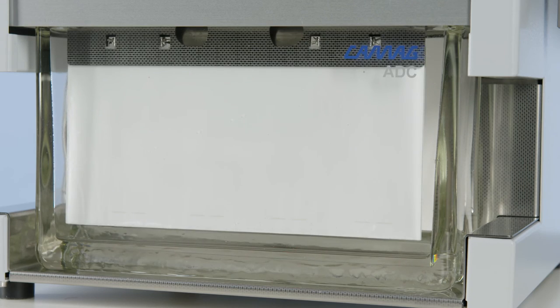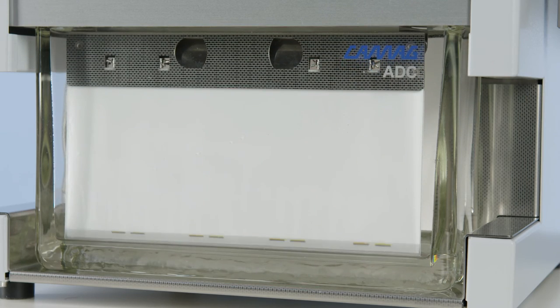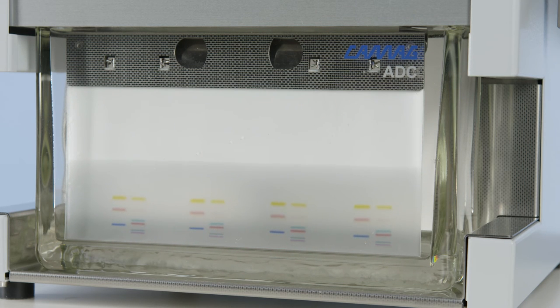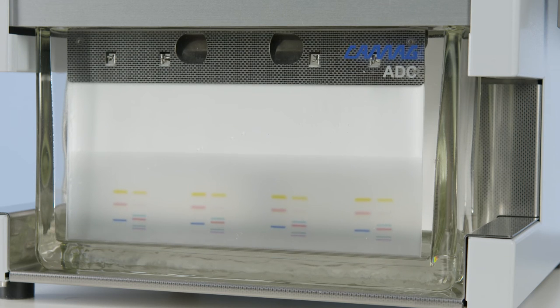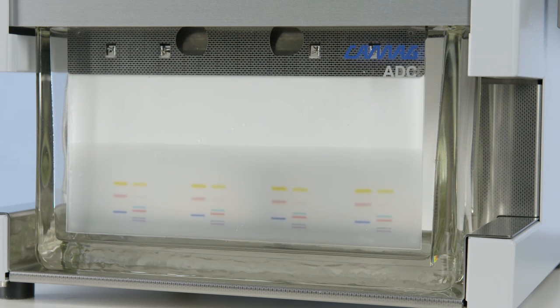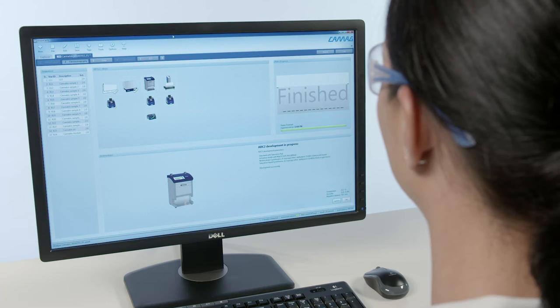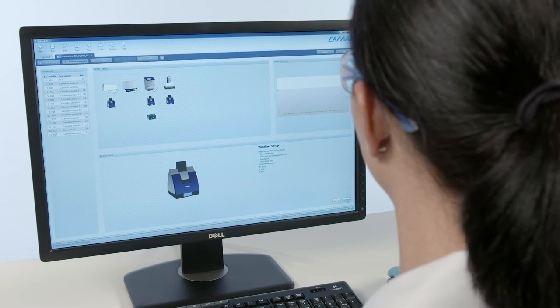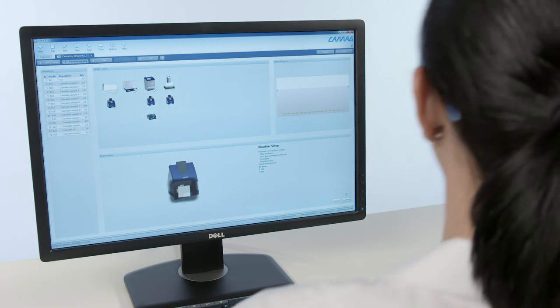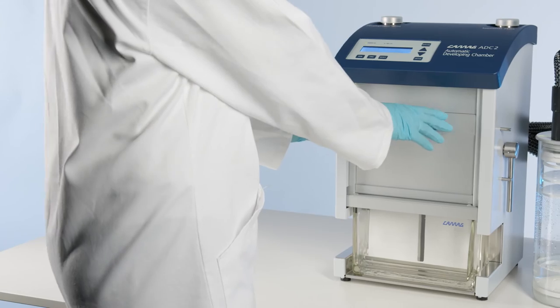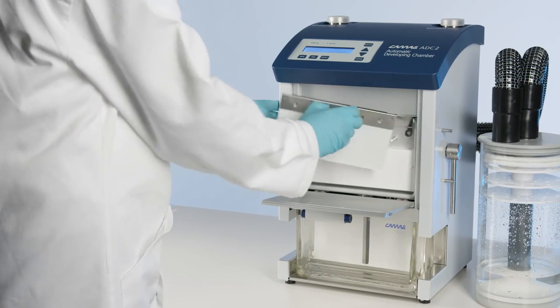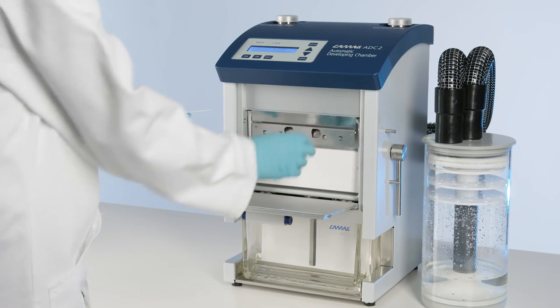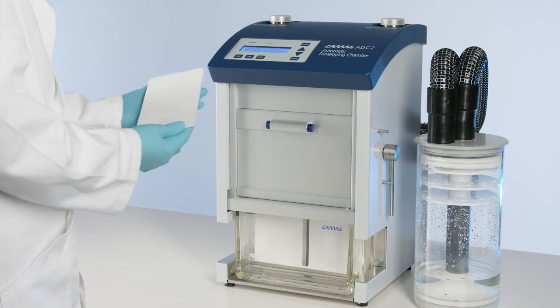Chromatography is started by lowering the plate into the developing solvent. During chromatography, the position of the solvent front is monitored. At the end, the developed plate is homogenously dried in an airstream. All parameters are recorded in compliance with CGMP-CGLP as part of the analysis. After successful chromatogram development, just open the front door of the ADC2 and remove the developed plate for the next step of the HPTLC process.